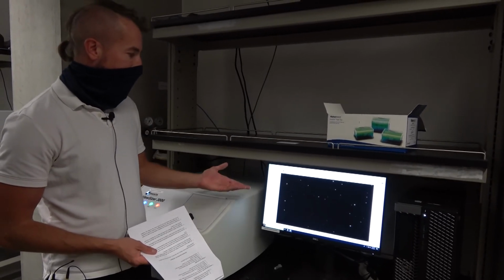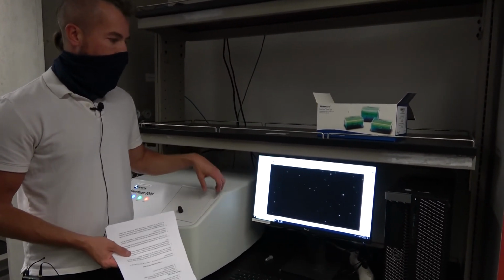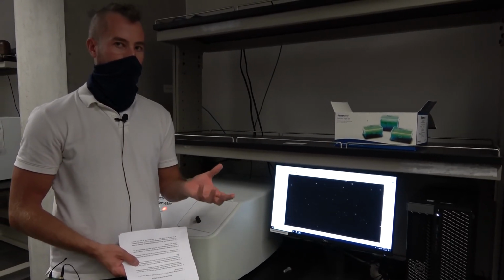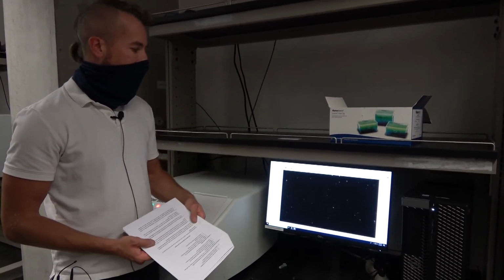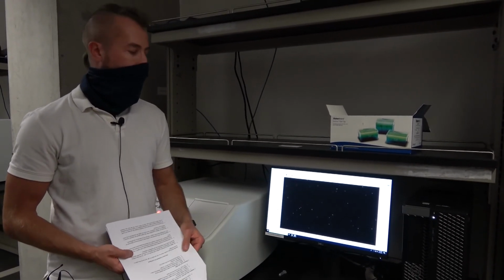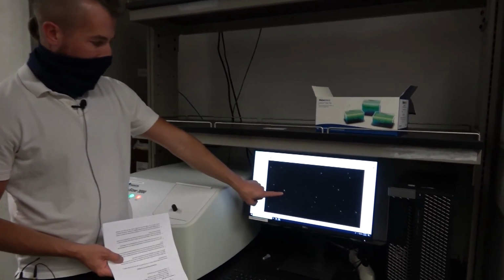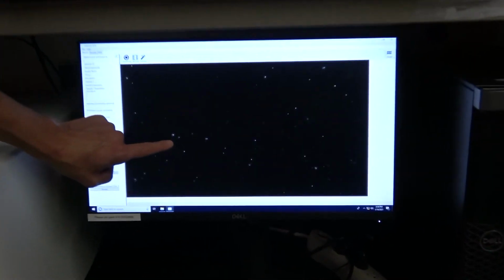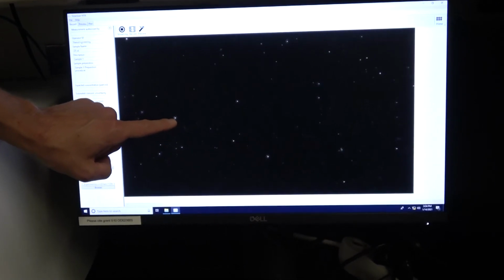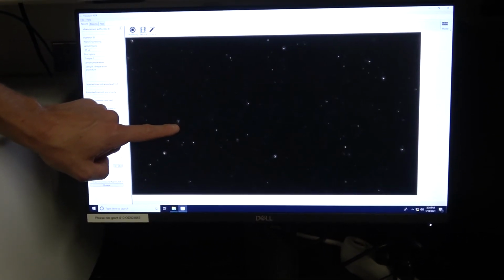So what you're seeing now is the 25 microliter sample, the one where we added 25 microliters of PBS and created the smallest nanoparticle size that you made out of the 3. And what you can appreciate here are these little nanoparticles wiggling around due to Brownian motion in real time.